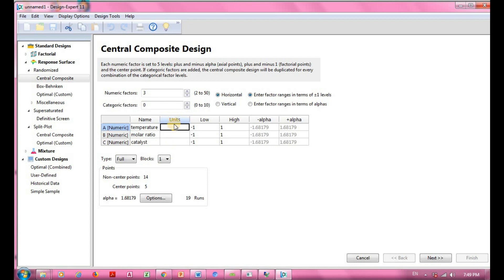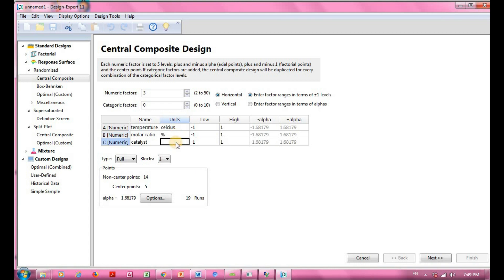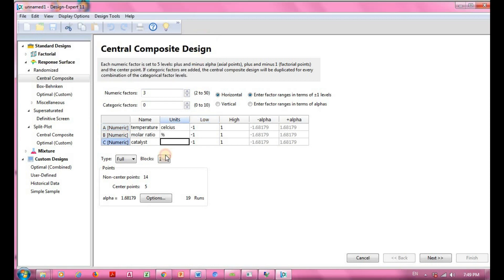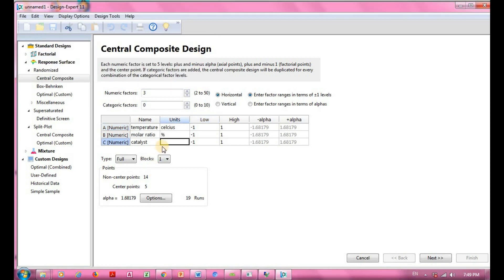Moving on to the units — it is up to you whether you want to specify units or leave it blank; it doesn't affect the results. For temperature I'll use Celsius, molar ratio will have its own unit, and for catalyst I'll use percentage.